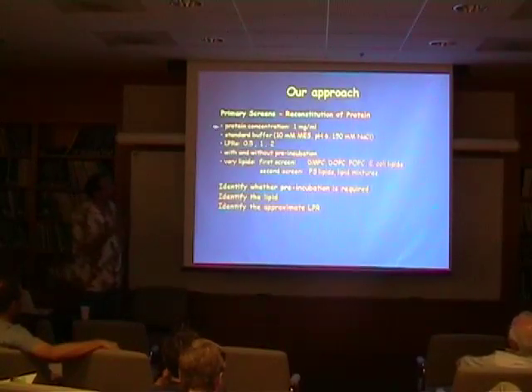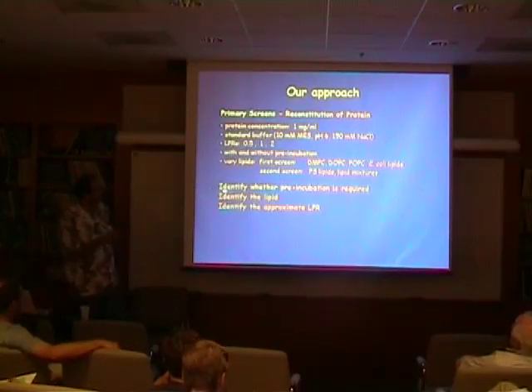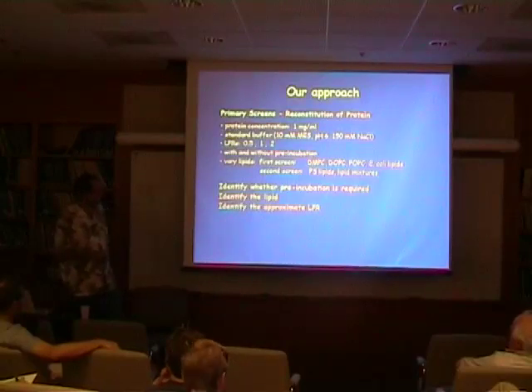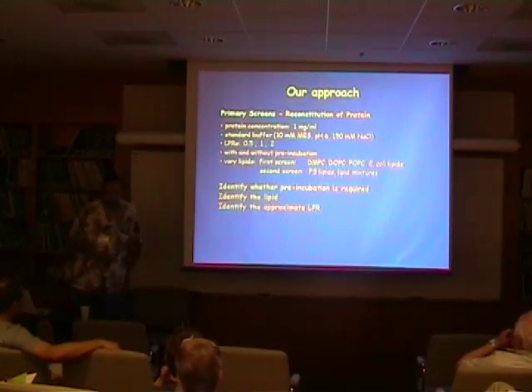So in such primary screens, what we really want to do is identify the lipid that works to reconstitute the protein. We want to identify whether we need to do pre-incubation or not. And this is something very new to me, because I actually told my people not to do that, but now I just came back from Japan and Yoshi swears that this is important, so now we try it again. So the rules are not long-lasting. And then we roughly get an idea, though this is a very broad range, of what the LPR would be that is useful.